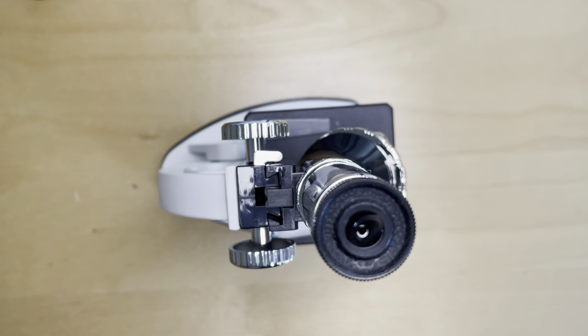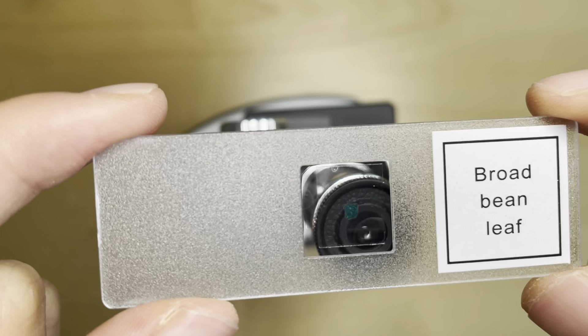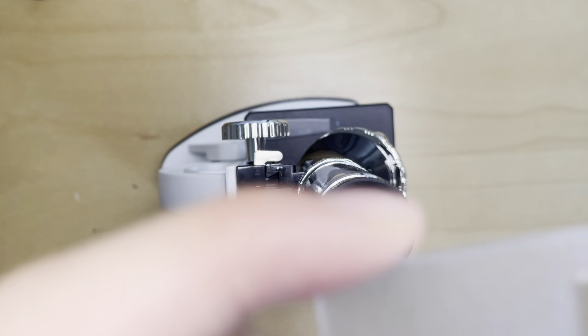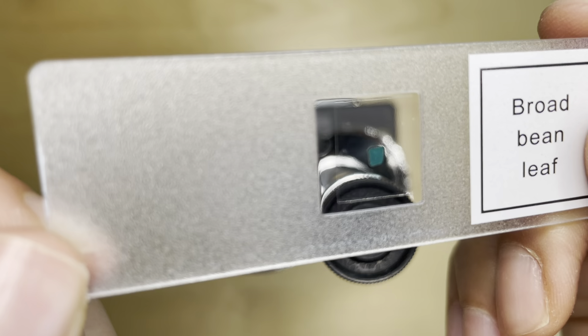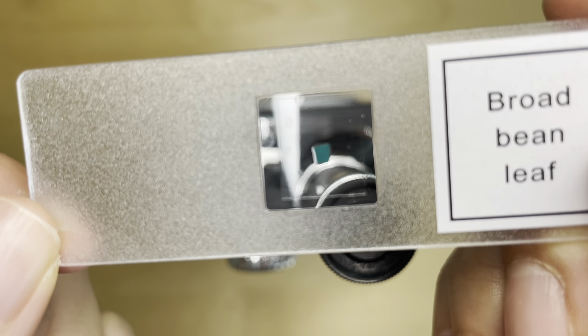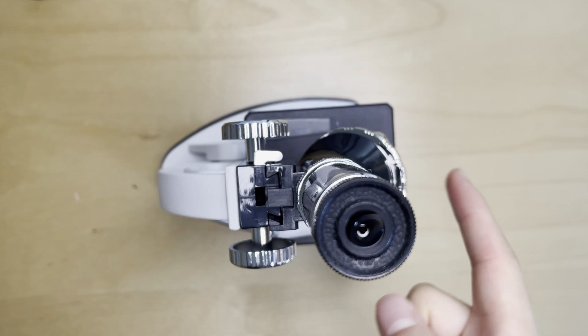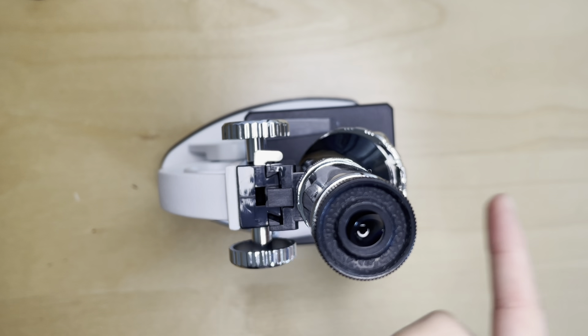Hello guys, welcome to the second video of our microscope series. Today we will examine the broad bean leaf and how it looks like under the microscope. I see that there are some air bubbles inside but that shouldn't interfere with our results. Now let's see what it looks like with the magnification of 8x.